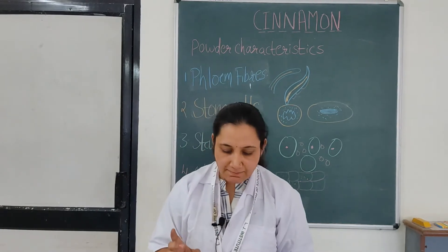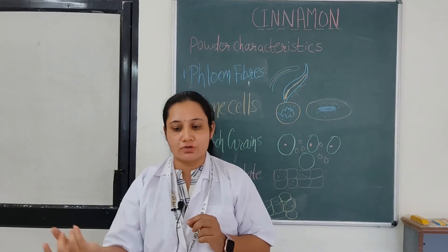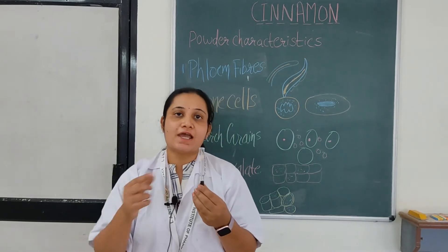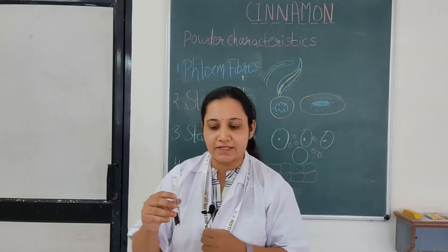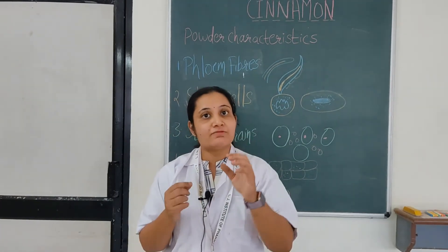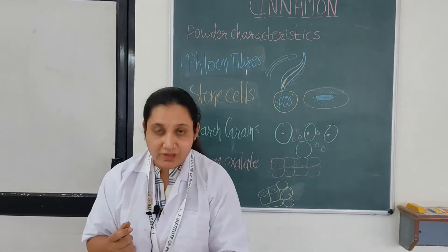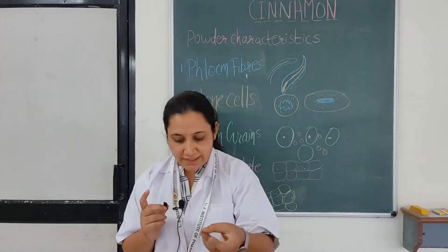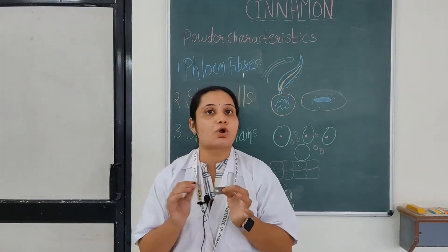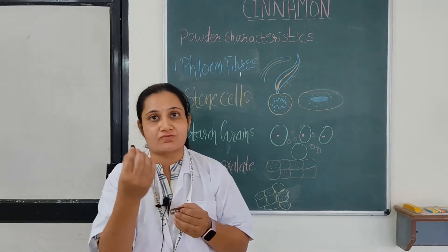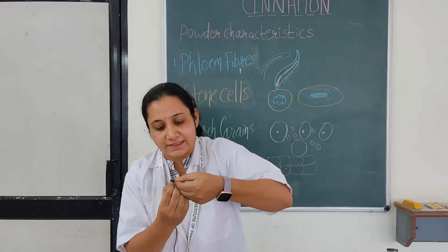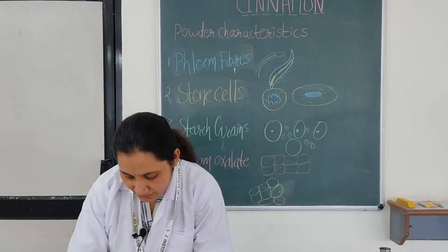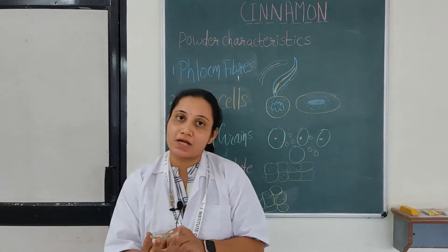For doing microscopy, the drug sample should be heated in water or chloral hydrate. We will take the cinnamon sample, add chloral hydrate, and heat it to make it soft. After heating, we will take out the sample, wash it with water, and then take a blade. Use the blade very carefully and keep it wet with water so that the cut section does not dry. Between two fingers and the thumb, we will cut 2, 3, 4, 5, up to 10 sections.